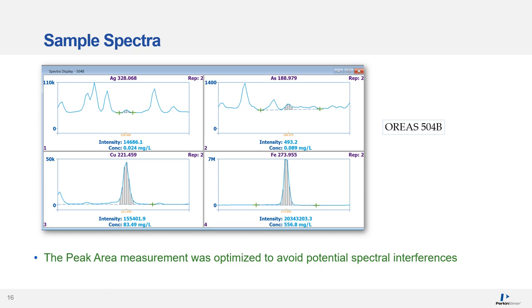This is an example spectrum for the certified reference material Oreas 504B. The grey bars represent the peak area being measured for each element, and the green crosses are the background correction points being subtracted from the analyte signal. For copper and iron, two large peaks are visible due to the high concentrations, while for silver and arsenic — the trace elements — the peaks are much smaller. There are also some wavelengths adjacent to the arsenic and silver analytes, primarily from the high iron and copper in the sample matrix. As part of method development, the background correction points were optimized to avoid these potential spectral interferences.